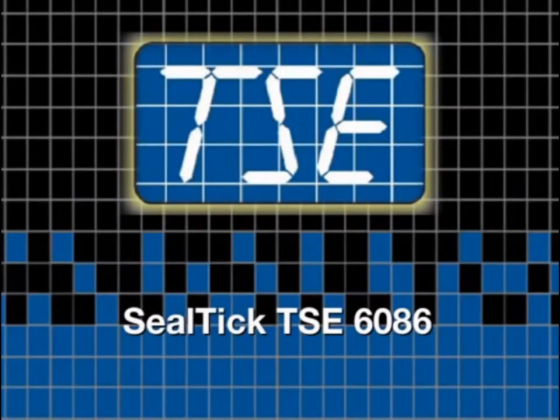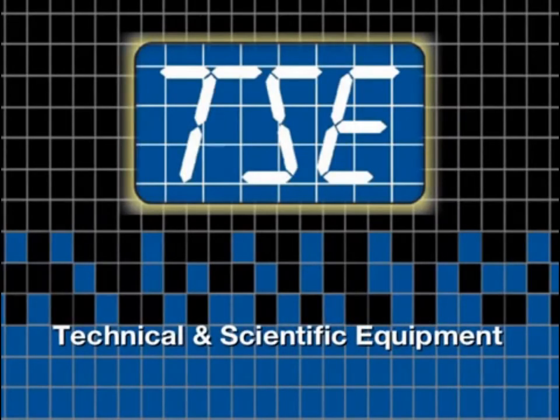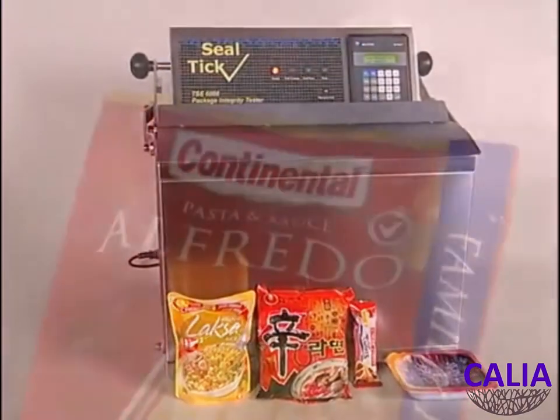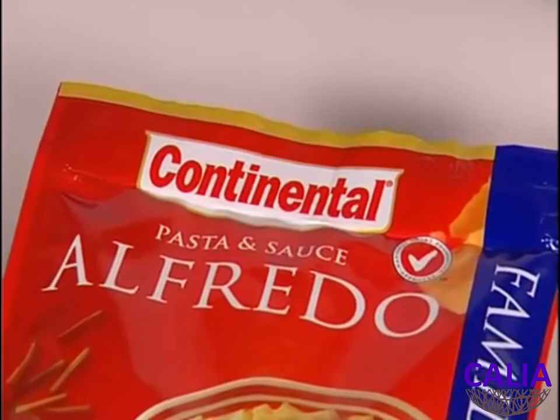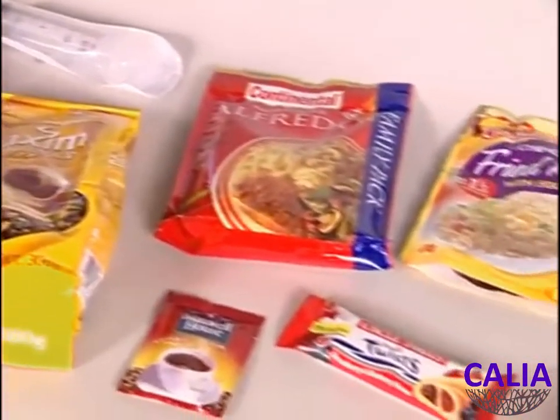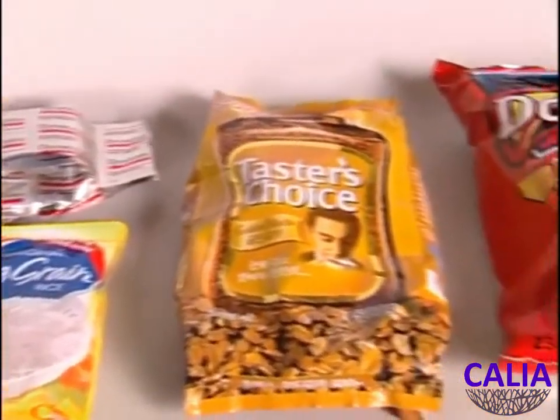The Sealtic TSE 6086 has been developed by Technical and Scientific Equipment to enable the testing of seal integrity in food and pharmaceutical packages. It ensures the seals have been made securely and are free of leakage, allowing the manufacturer to be confident about the shelf life and integrity of his product.